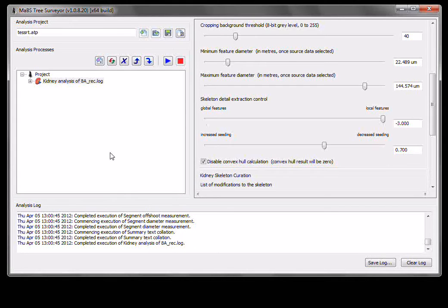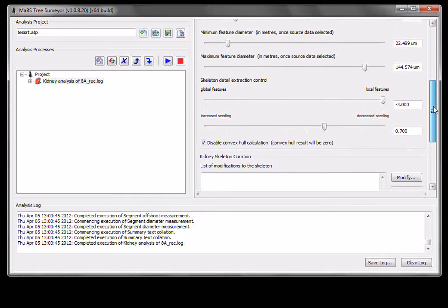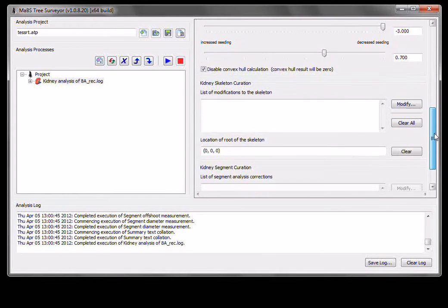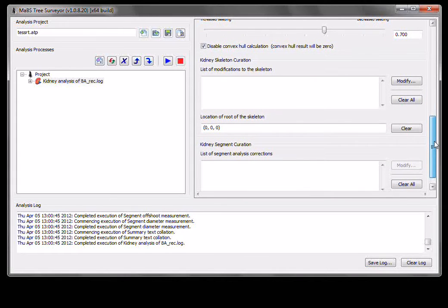The software will actually use multi-core processors. Not all parts of the software are multi-threaded, but some are, so there are some benefits to using a modern AMD or Intel processor to access that. There is an Intel math library that's used for a lot of the 3D calculations, so there is some benefit to using a modern Intel processor.